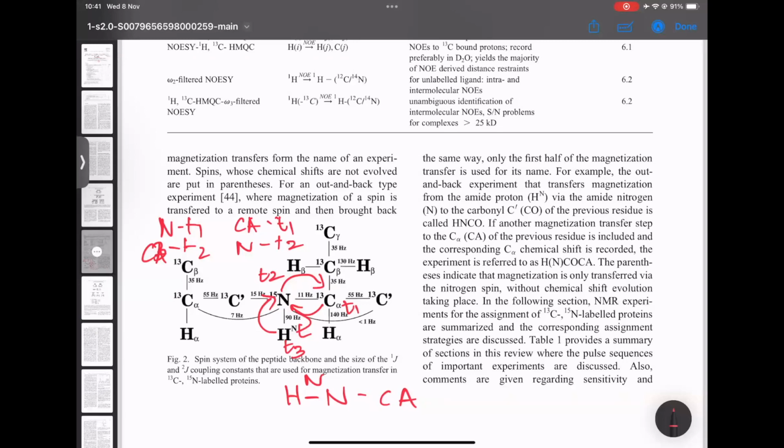As much as you have to repeat the two-dimensional experiment at least 2 times to get the indirect dimension frequency, in this experiment, since you have 3 dimensions, you have to repeat the experiment at least 4 times to get the indirect dimension frequency of, say, carbon and the indirect dimension frequency of nitrogen. So the experiment time also increases significantly. Did that make sense? Okay.